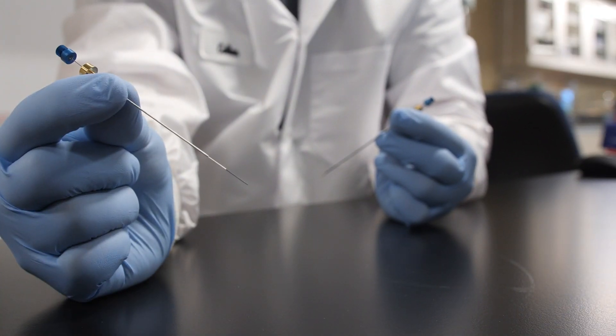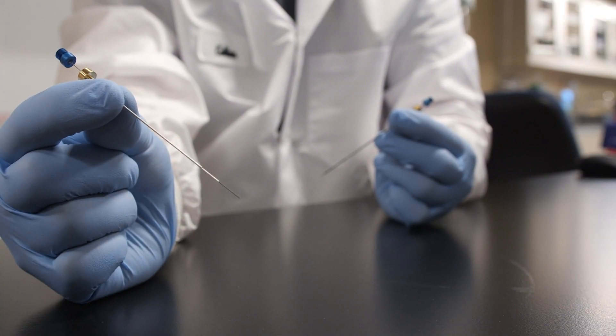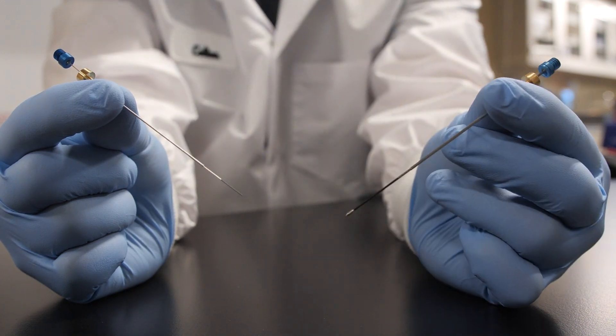SPME comes in a multitude of devices and geometries. Here, we have the SPME fiber and the SPME arrow. Each of these are available in a selection of coatings, which you choose based on your analytes of interest.